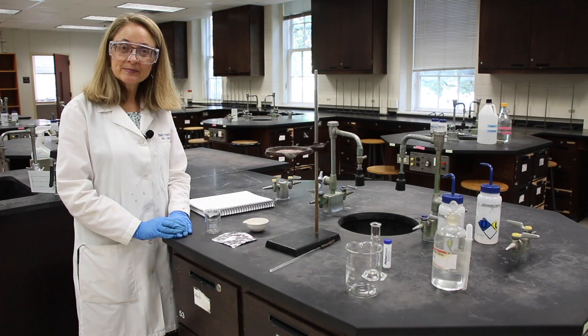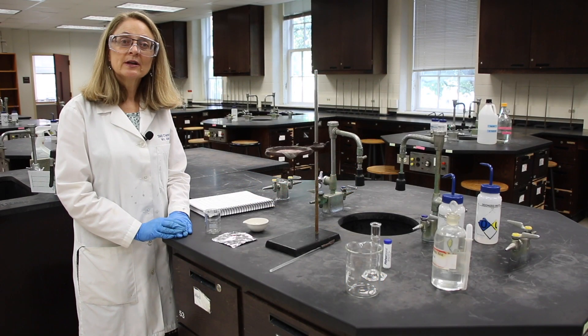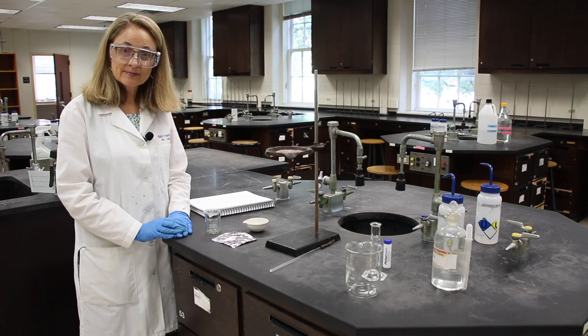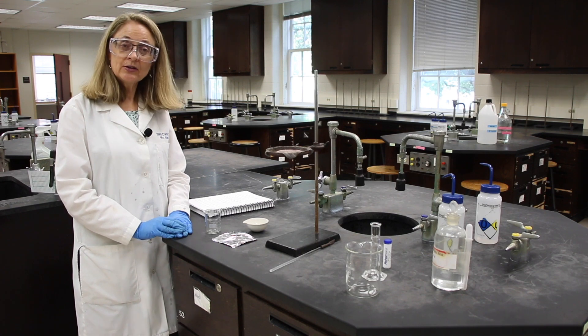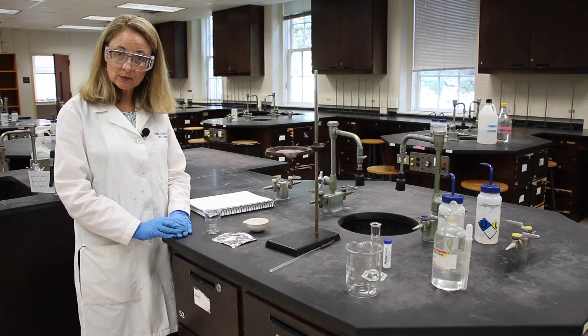Hello, welcome to lab. Today we're going to be doing limiting reagents. I'd like you to be my lab partner and I'd like you to follow along in your lab manual.